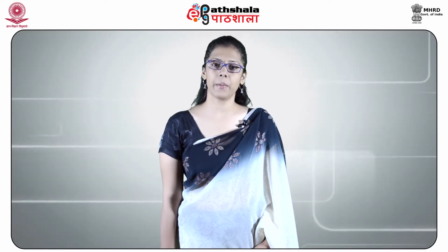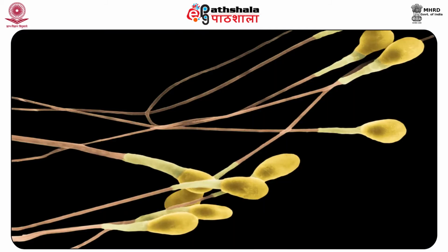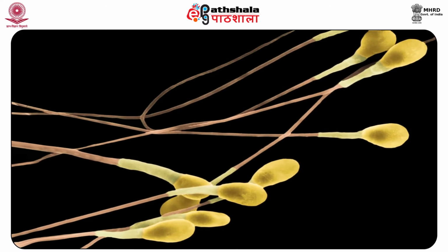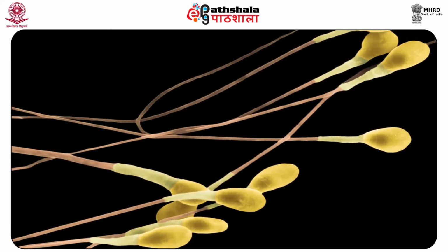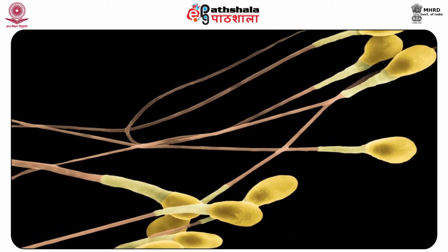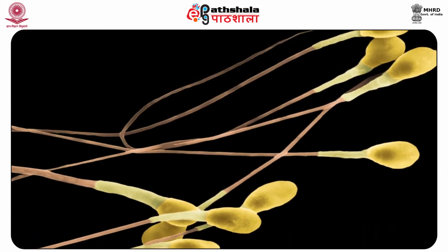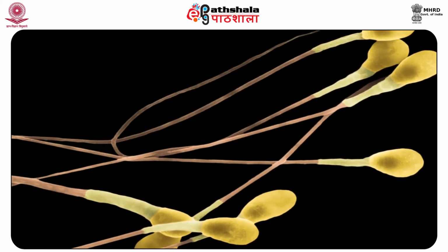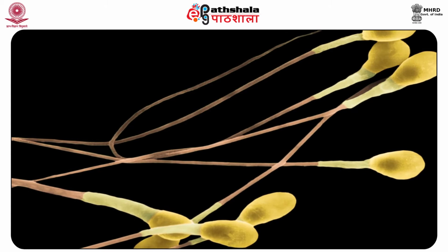Next we have the Barberio test. This was invented by Barberio in the year 1905, when the questioned stain is allowed to react with picric acid. It leads to the formation of yellow needle shaped spermine picrate crystals, indicating the presence of seminal stain.